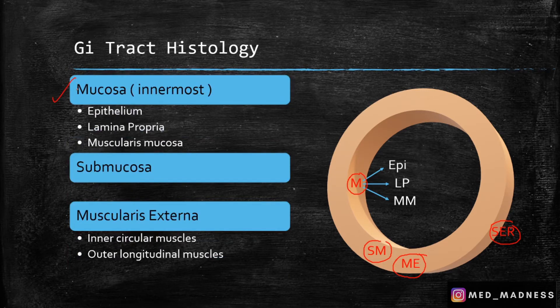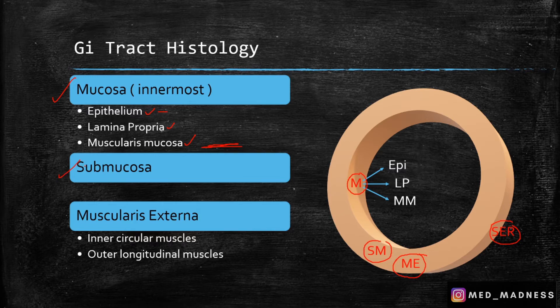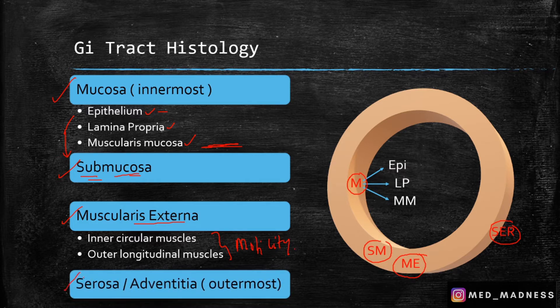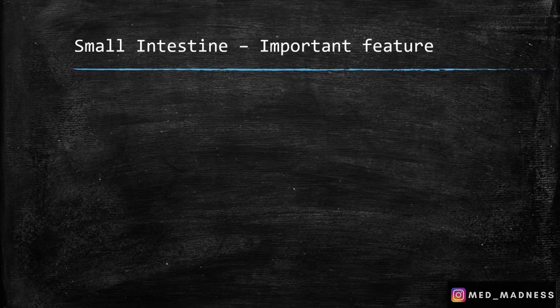The mucosa is the innermost layer of the GI tract. Here you can see the epithelium where you can see cells like squamous cells, columnar cells, etc., then comes the lamina propria, and then the muscularis mucosa — this marks the boundary of the mucosa. Then the submucosa, which means beneath the mucosa. Then the muscularis externa, where you have circular and longitudinal muscles that help with the motility of the GI tract.